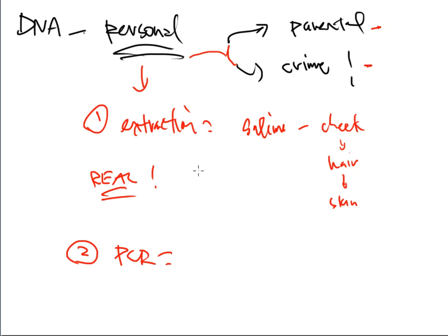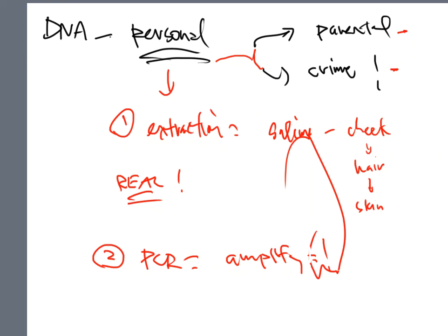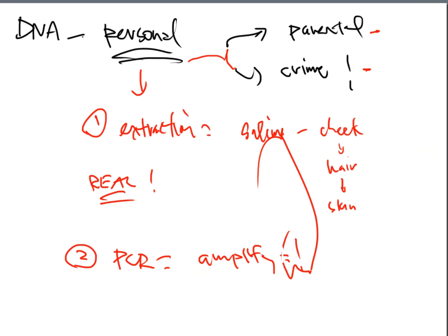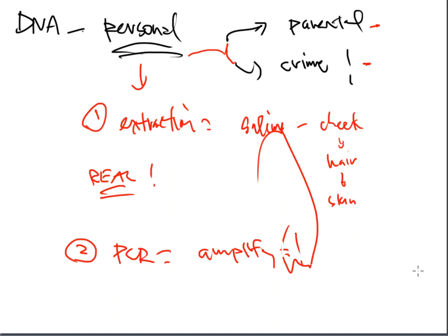And then we are going to amplify actually our own DNA sample, right? And this is, again, the first time that this is going to be done with us. So that's even better. That allows us to get a little bit more real, actual hands-on lab experience using these processes in a laboratory.